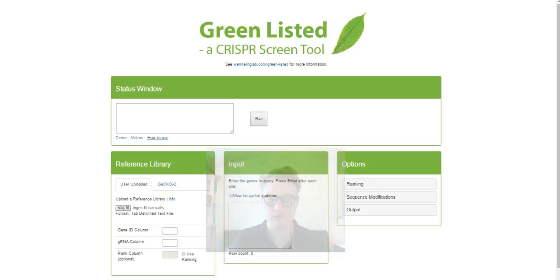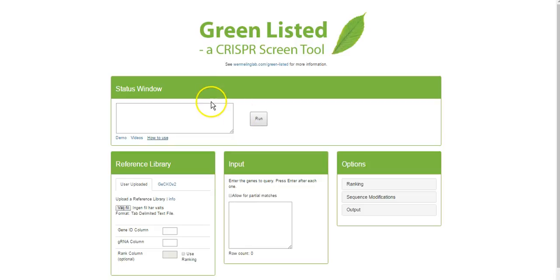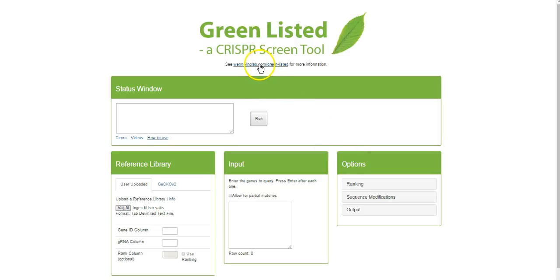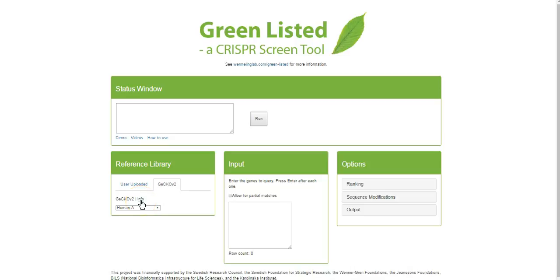Let's get started. This is how the web interface of GreenList looks. You'll see that there are four boxes here which we'll go into in detail. There are two boxes down here that really need your attention when you're designing the library. You can also see that there are links for more information throughout the interface.